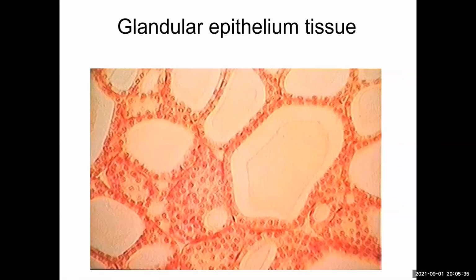So we refer to it as glandular epithelium because it's producing something. But on the test, if you were to call it simple cuboidal epithelium, I wouldn't take off.